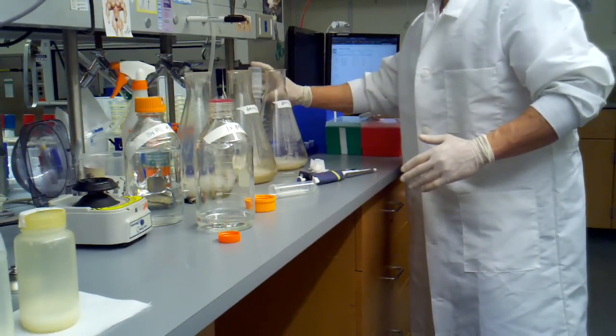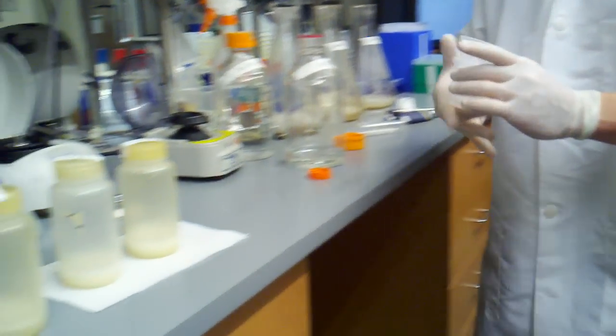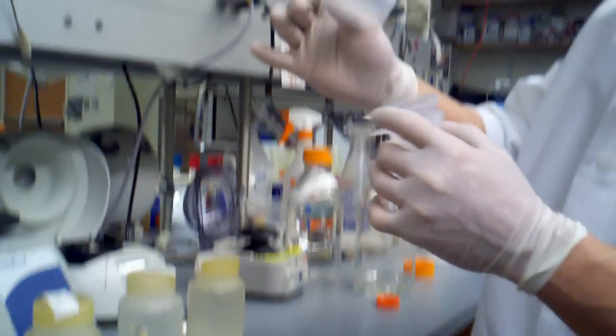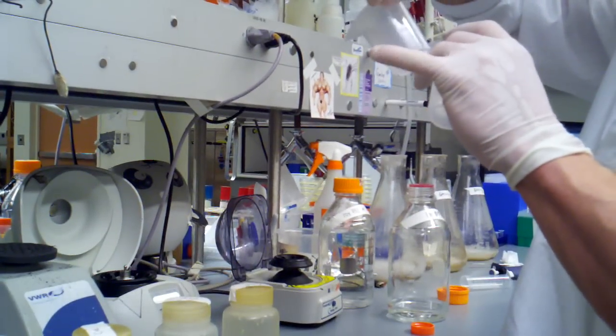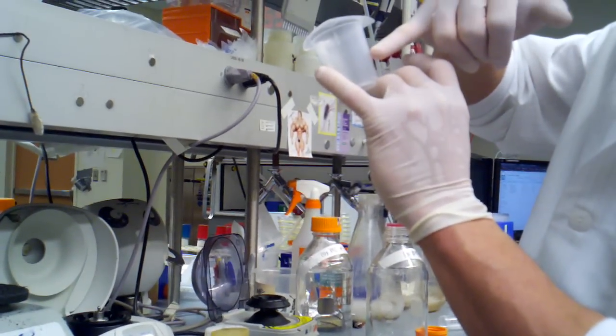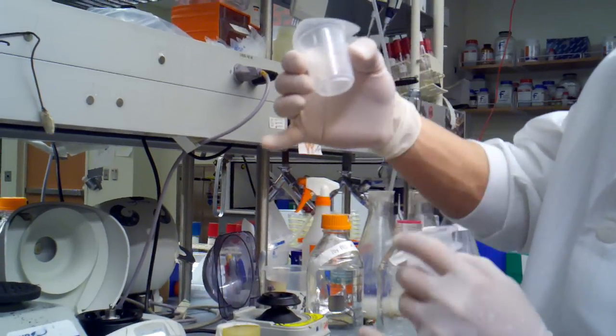And now we are ready to sonicate. So, in order to sonicate, we're going to be using these little mini cups. They hold 50 mils, so 25 mils is about right there. Plus the pellet will probably take us up to about 30 mils.